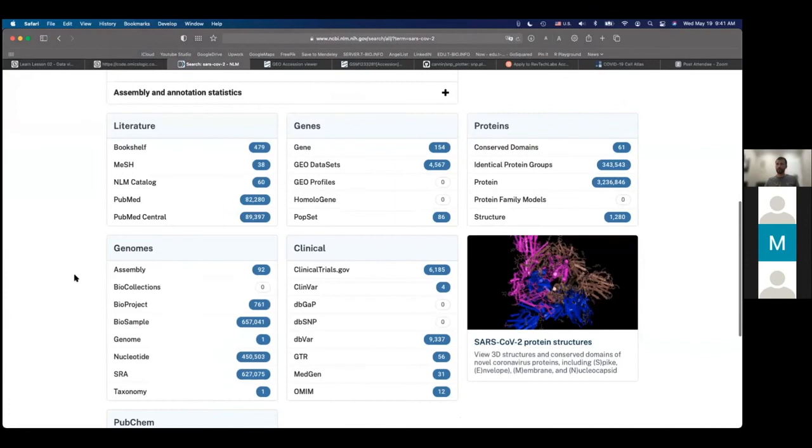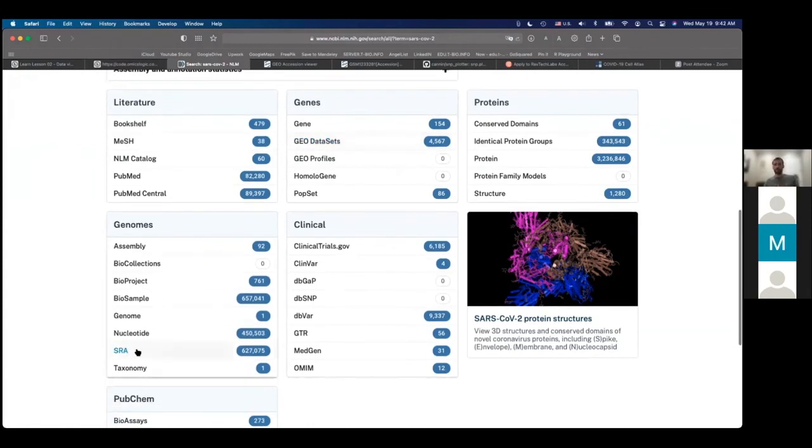When you scroll down right here, you see a lot of different types of data. Now, for our purposes, for transcriptomic data analysis, there are going to be two repositories that are most interesting. The first one is GEO, which stands for Gene Expression Omnibus. These are typically already tables of gene expression that you can just download and analyze. Or SRA, which is Sequence Read Archive. And remember the pipeline that we built to actually process the individual reads and map them onto the reference genome to create a table of expression? That's what we would use here.